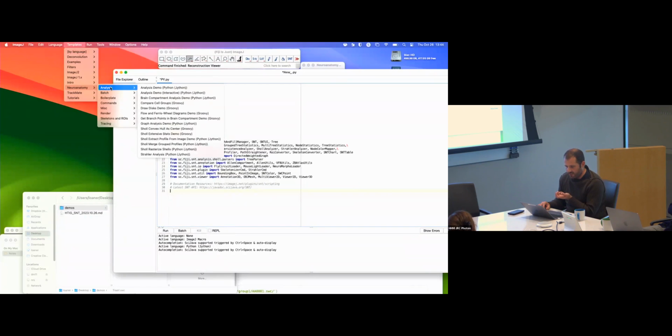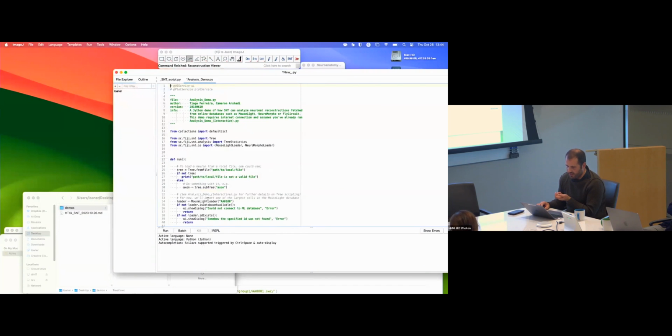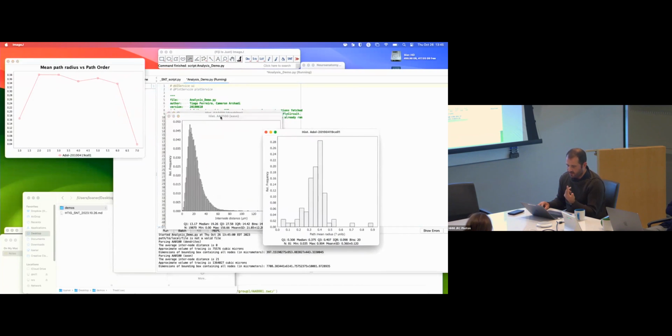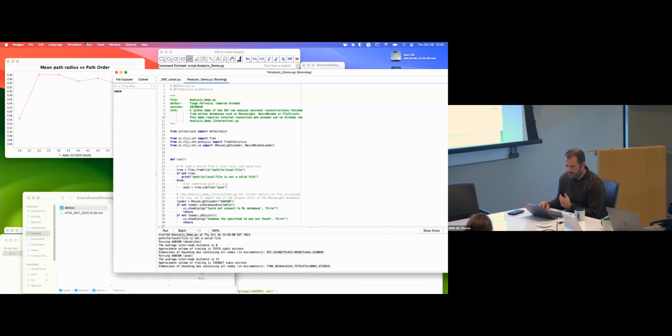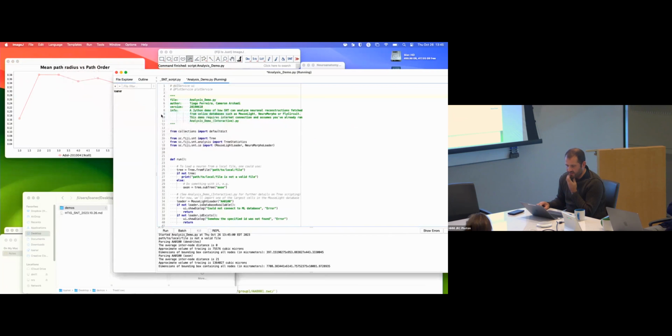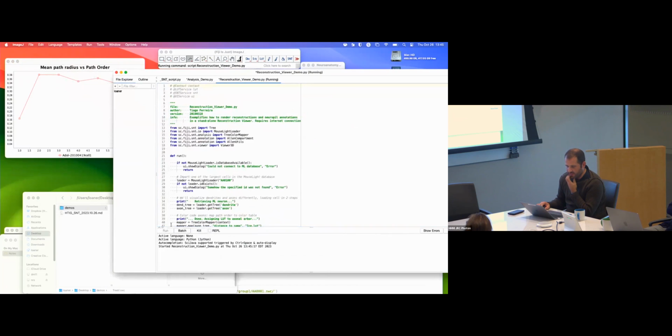And then we also try to make these, we don't succeed all the time, but we always try to make the demo scripts here so that you don't need to type in any data. So in this case, I don't even know what this script does, but we need to look at it. But, for instance, you can do, let's say, the render. Yeah, okay, so there's this demo, you can try to run it.